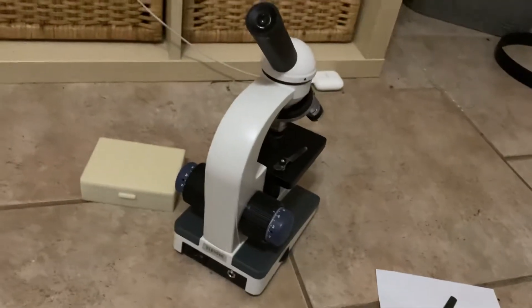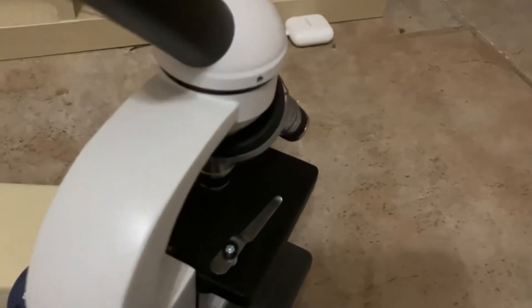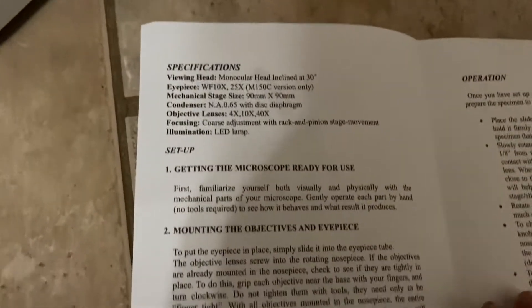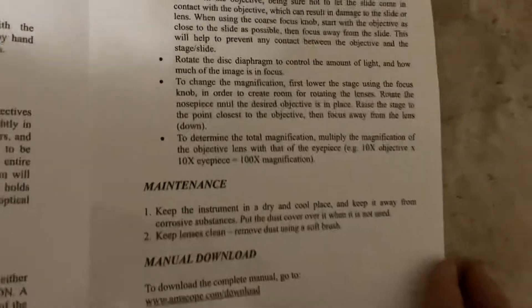Hello internet, today I'll be using this microscope. Here's the manual it came with — model M150 biological microscope, it's a bit torn, sorry. Here are the instructions if anybody wants them. The way you turn it on is you click this and then it's on.